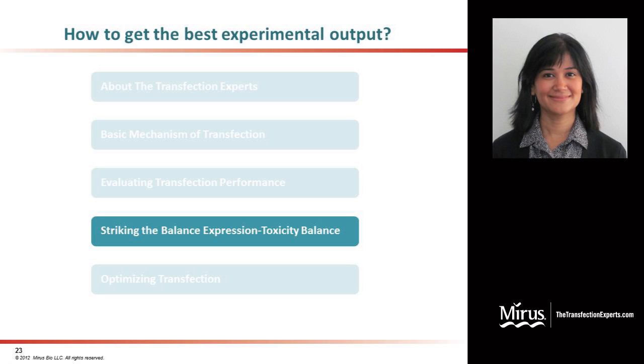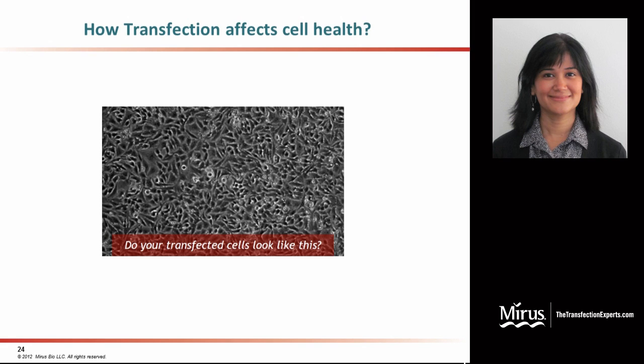If you recall from the earlier mechanistic slides about transfection, it is a highly membrane-active phenomenon. There are a lot of endocytic pathways involved, and there is a lot of membrane reorganization within the cell following transfection. A harsh reality, therefore, of most transfection methods is the associated cellular toxicity incurred by these techniques. Here is an image illustrating how transfection can really affect cell health. Typically, you would want your cells to look healthy and morphologically fine, with no effects on cell viability, etc., following transfection.